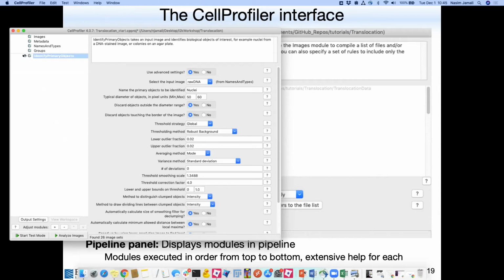And what this eye button does, when I go to test mode, we see 4 different buttons here. Again, we get to work on these in a second, but I just want to show you the purpose of the eye.